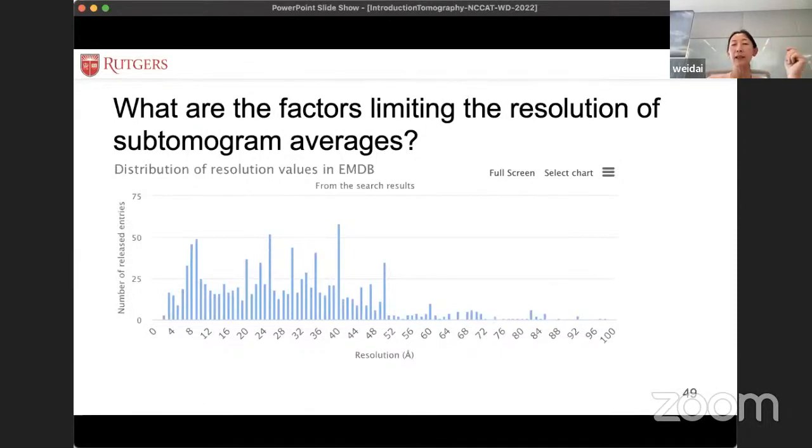Data processing. And very often, using my example, like the membrane fragment versus purified protein, generally speaking, the ice thickness is higher in membrane fractions compared to purified membrane proteins, right? So the complex environment is definitely going to play a role in limiting the resolution.